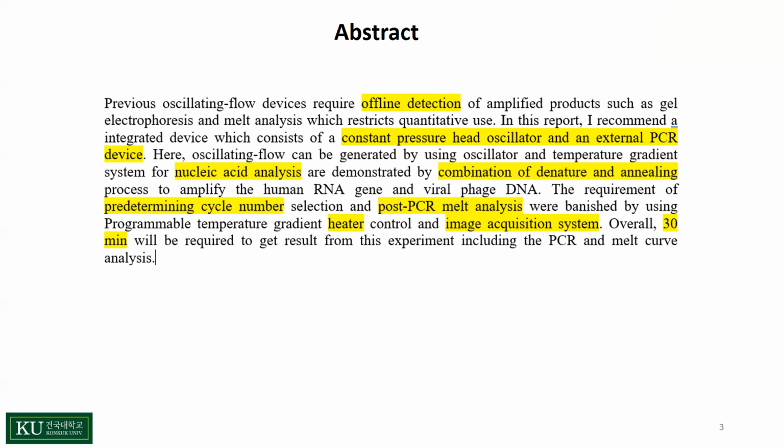The previous oscillating flow device required offline product detection. It cannot do live quantitative analysis.